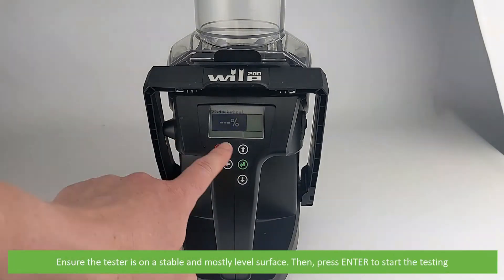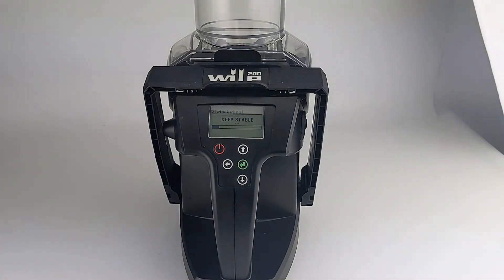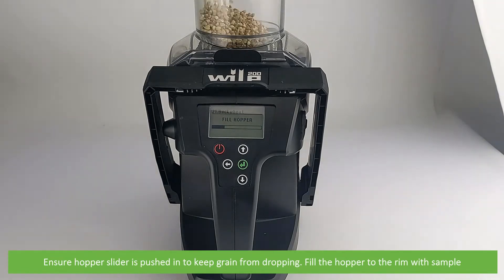Ensure that the tester is on a stable and mostly level surface, then press enter to start the testing. Ensure the hopper slider is pushed in to keep the grain from dropping into the measurement area.